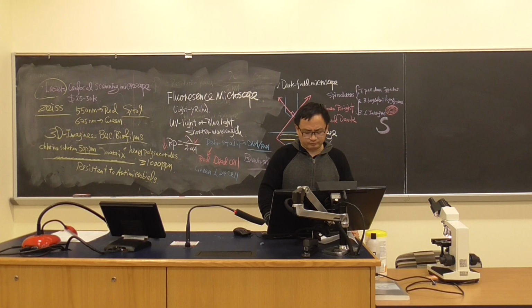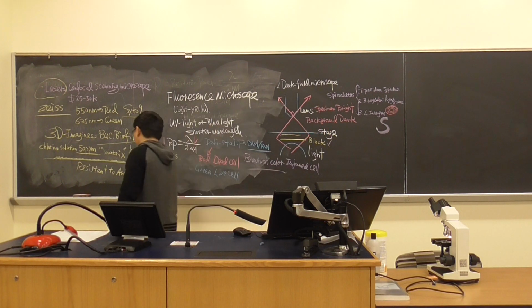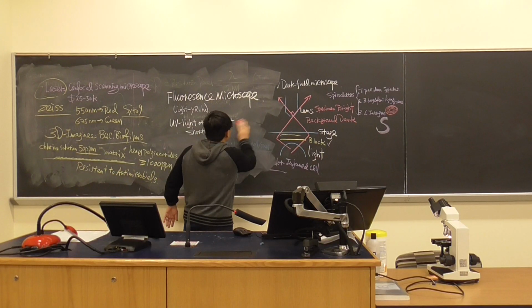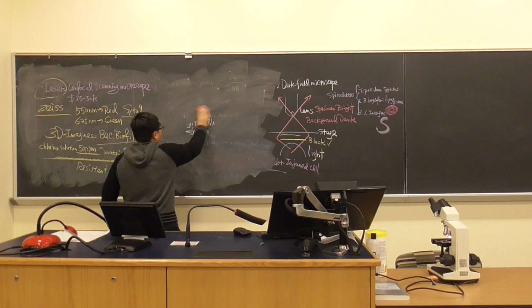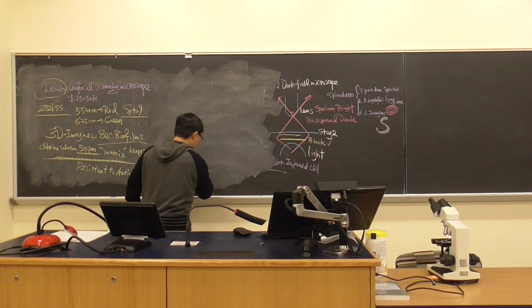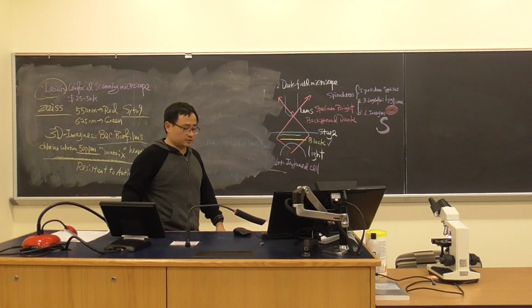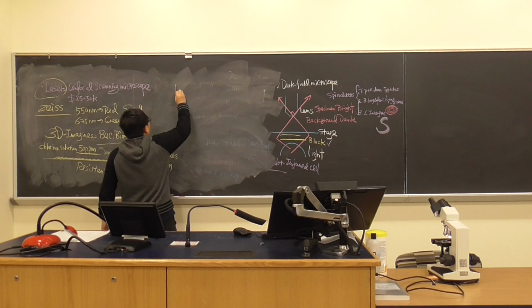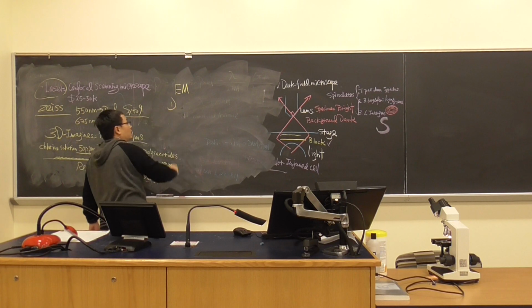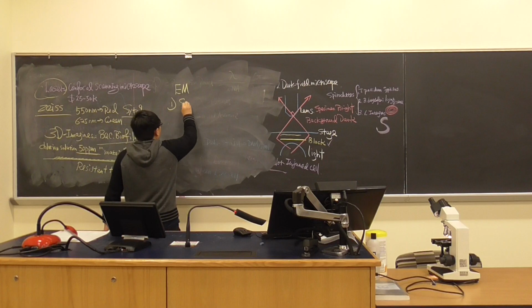Okay, we have some time, so we're going to be very brief and talk about the electron microscope. We already mentioned that you need to go through the training. I don't have that in my lab. I mean, we don't have the capacity to do it. So we basically categorize electron microscopes into two categories. Number one, we call SEM.